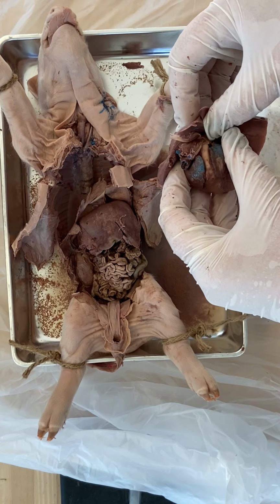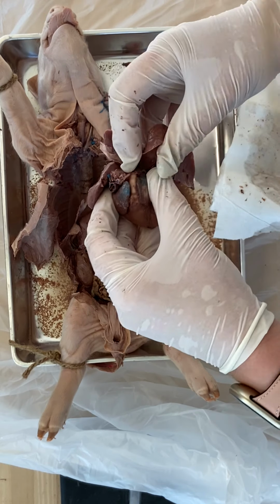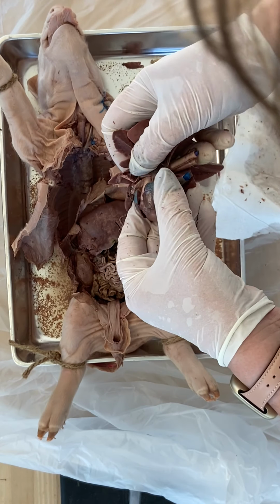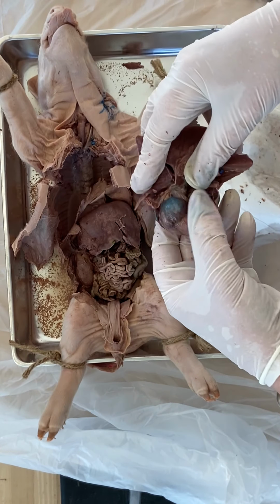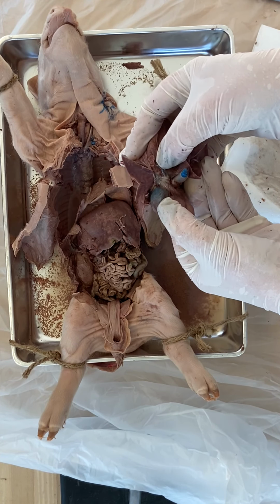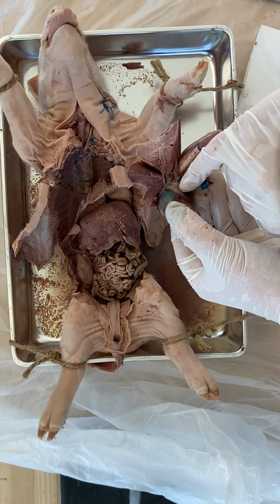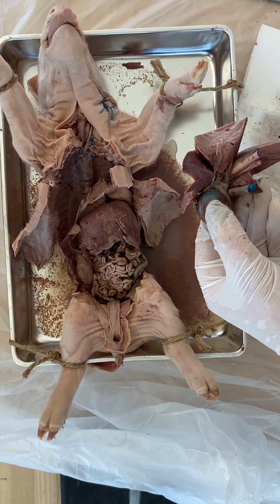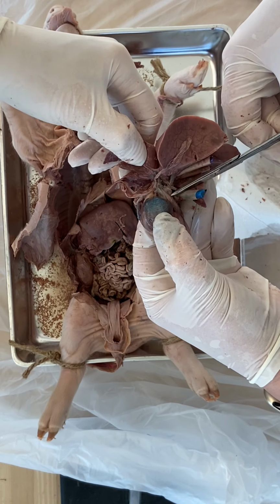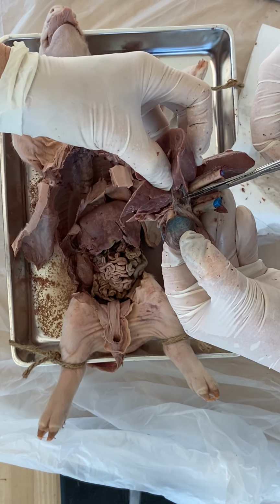Sure. See if we can. Do you need a blade? I think so. Oh, here we can see some. Here's the arteries going into the lungs. These are the pulmonary arteries, yes? Yes, the little skinny ones. So this is the descending aorta, so we're here somewhere. And if you go in and cut those, you'll be able to see at least the holes going into and out of the heart.